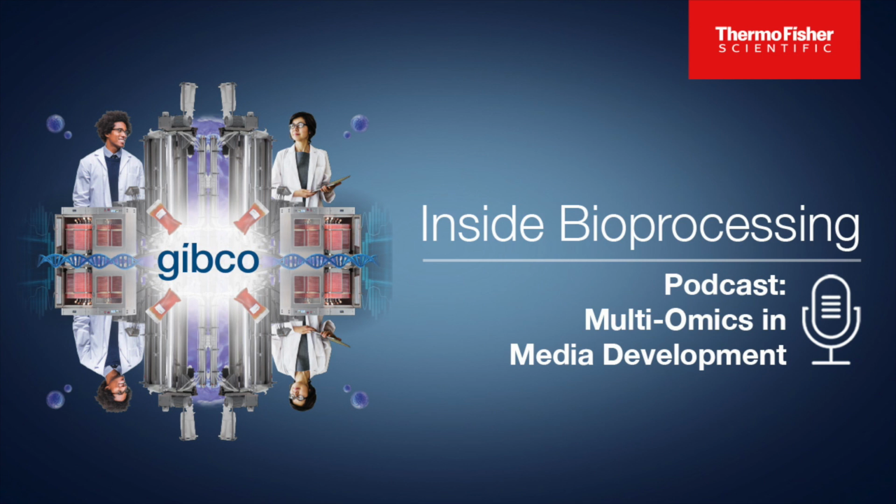So, in order to create more robust processes that are going to produce these molecules in the consistent quantities that we want, to the quality that we want, in an affordable way, so that it can be democratized across all people, then we're going to need a much more in-depth understanding of how these processes work and what levers we can pull to make them better. And multi-omics does that. Spent media analysis is a fantastic process. The traditional approach has worked for many, many years, but we are very quickly getting to the point where the improvements that we can get from the traditional approaches simply aren't going to get us to where we need to be in order to enable some of these new technologies that we want to produce in the biopharmaceutical industry. And so that's where I see multi-omics playing a critical role in giving us the understanding that we need to be able to get these therapies in a way that they are actually affordable and available to everybody rather than just a select few.